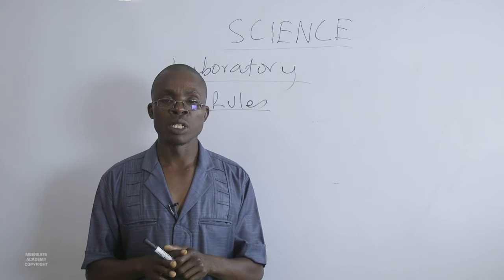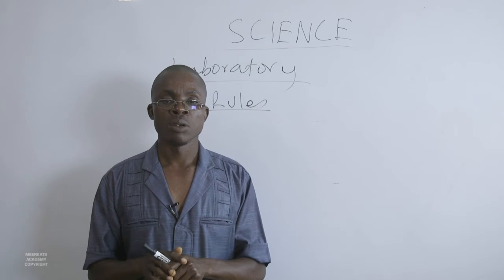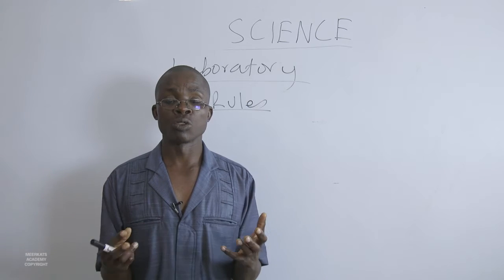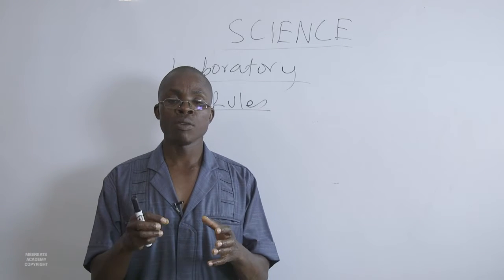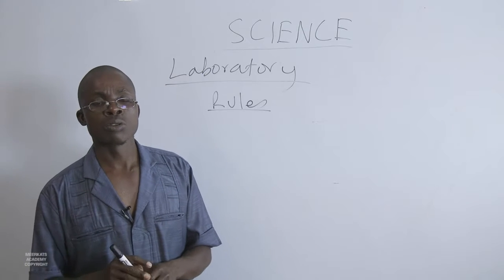So please always enter the lab when fully covered with your foot and even all the other parts of your body, and that's why you should always be in a white coat, which is very good in covering you, and it is not loose in any way. Don't have a white coat that is loose. The other thing is to do with your eyes.